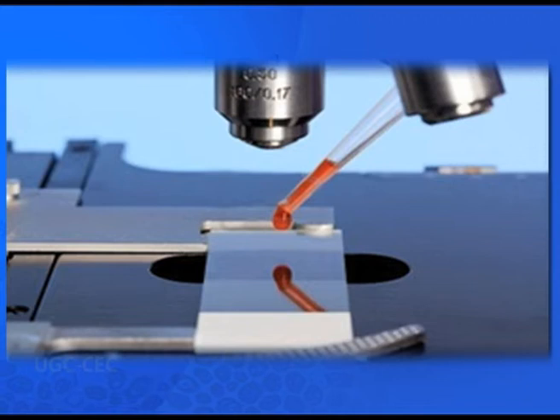This generally involves fixing of cells which kills them and one cannot visualize live cells. I am sure you will be learning about various staining techniques in your practical classes. However, staining involves fixing of cells and fixation kills these cells, and we cannot visualize the live cells. To overcome this problem, a new technique has been developed which is called dark field microscopy.